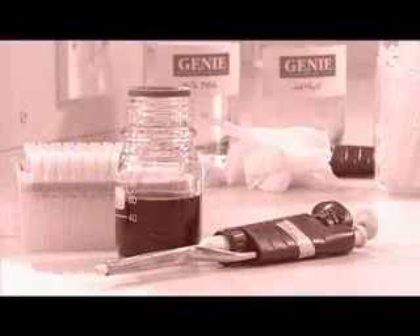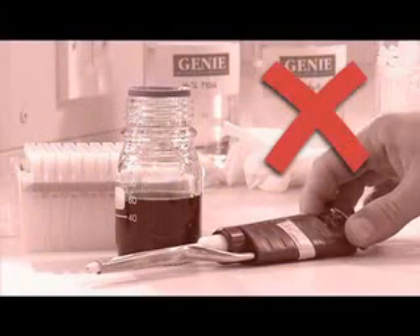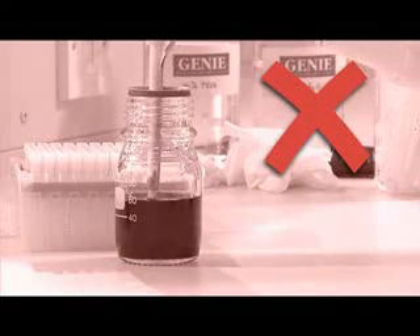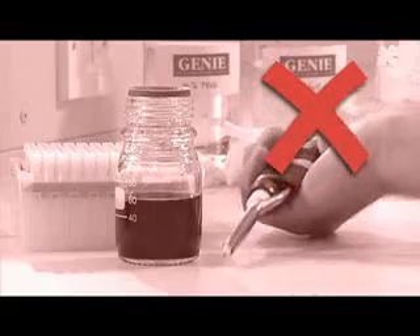Do not use a pipette without a tip attached. Liquid should never enter the body of the pipette. It will cause the pipette to corrode and will be a major source of contamination between liquids and experiments.